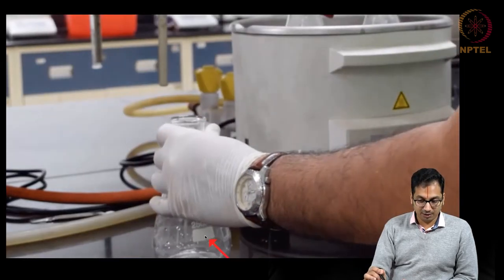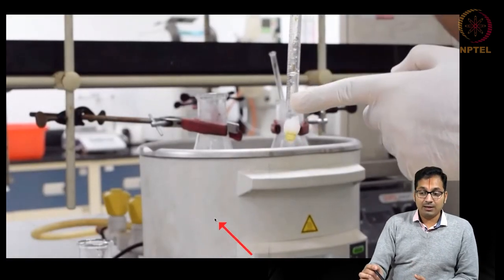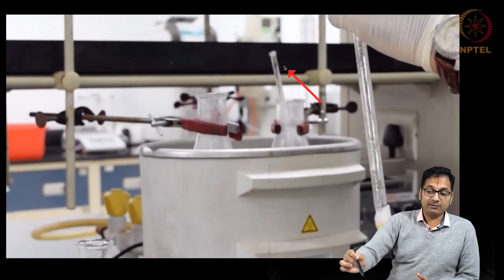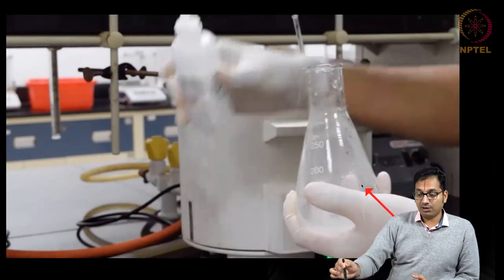and now you might find some solids here. That is not a problem. As you might realize, from 56 degrees, if you are going to a lower temperature, you are going to have some solids that come up. You might also realize some of the benzoic acid might have solidified in the pipette itself. It is a good idea indeed to wash the pipette with hot water so as to make sure that you are getting all the benzoic acid out.